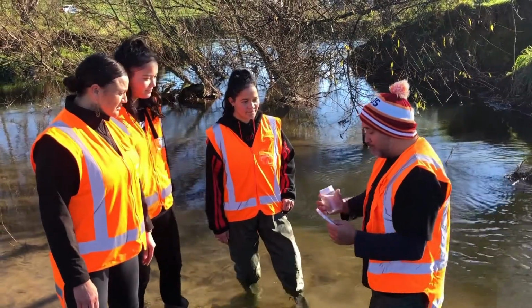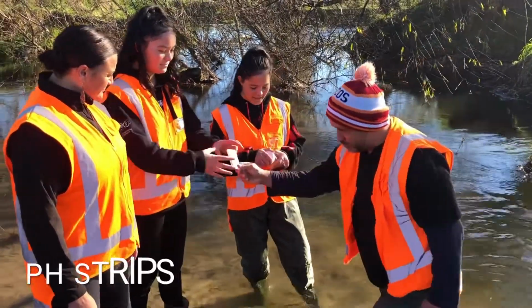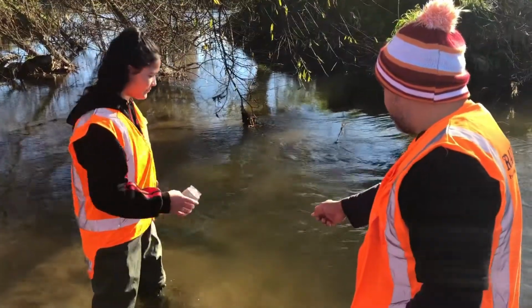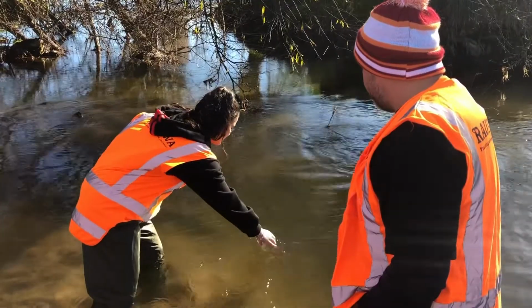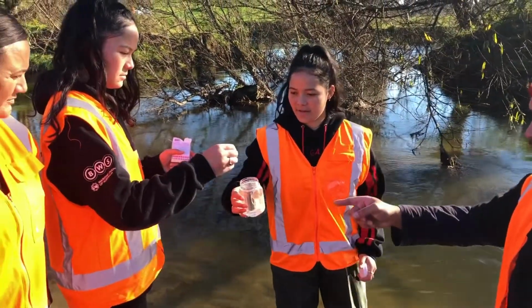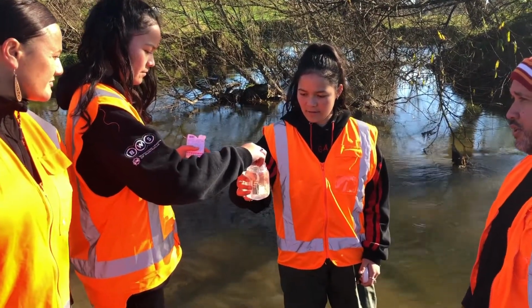Right girls, we're going to measure the pH level. All we need: container and pH strips. Ka pai? Alright. So you fill up the container out in the clear spot of the river. Yep, cool. Now what we want to do is submerge the strip in there for 30 seconds. Hold it in there for 30 seconds.